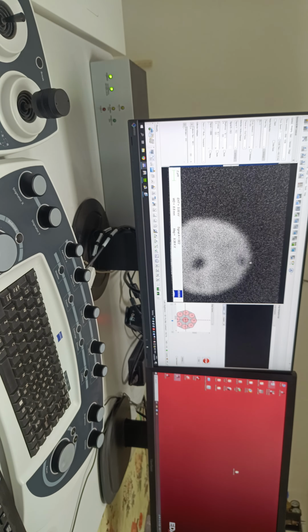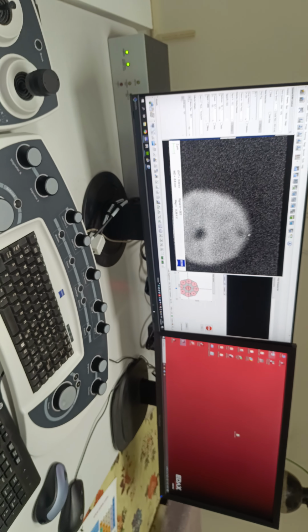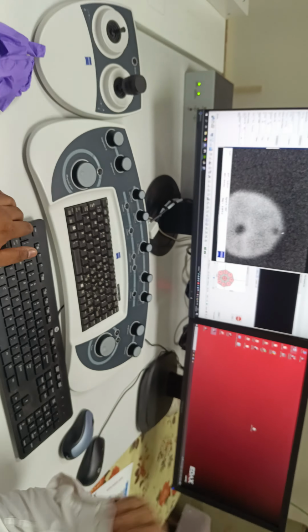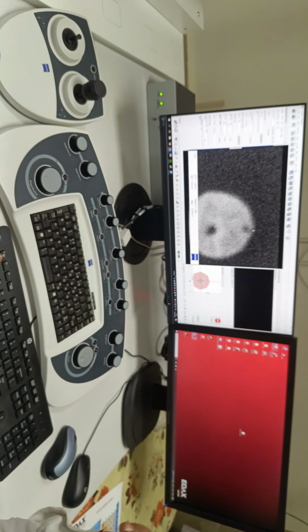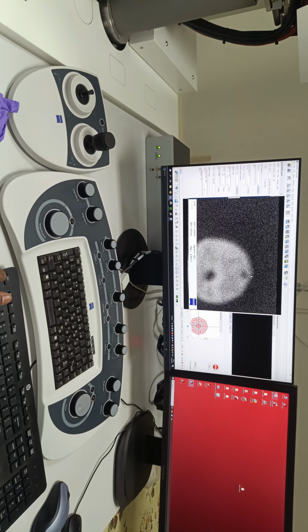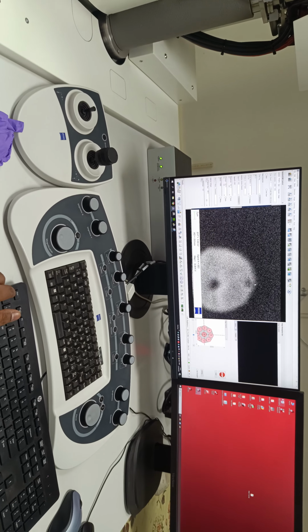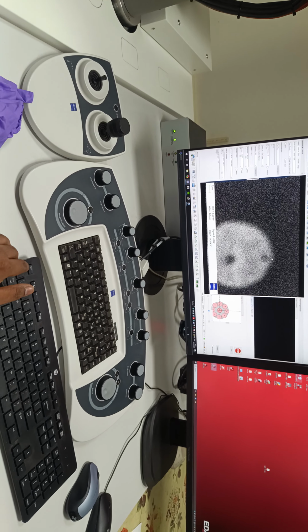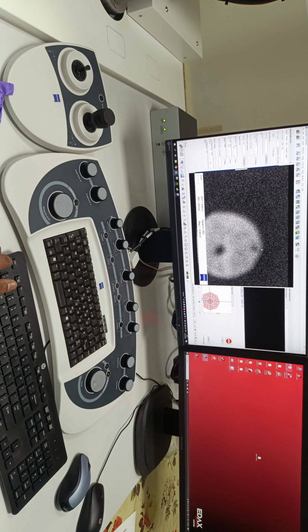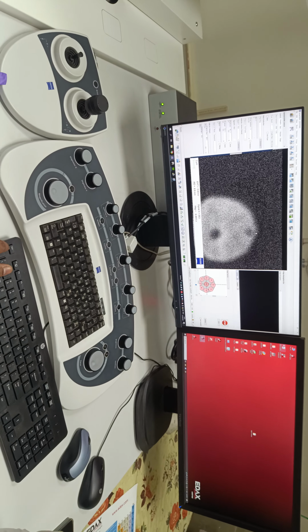For beam sensitive samples, we preferably go for a lower kV. How low we should go really depends on the nature of the sample. Variable pressure has some advantage there. I understand your question, so basically we have to optimize.